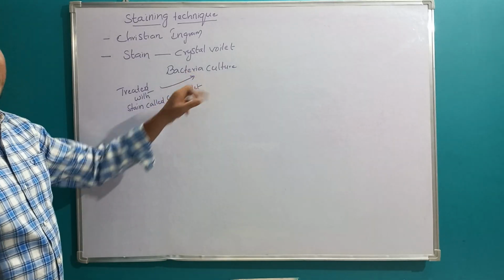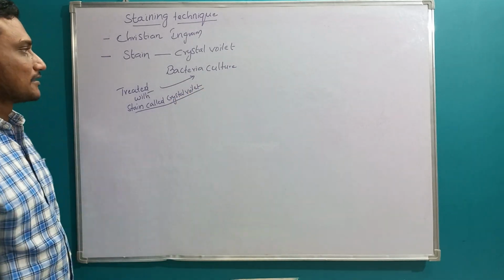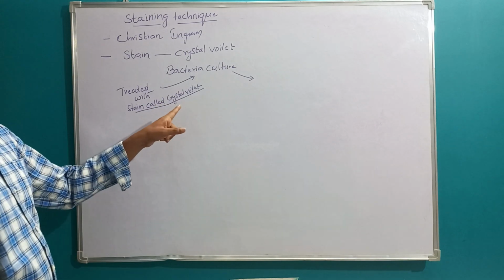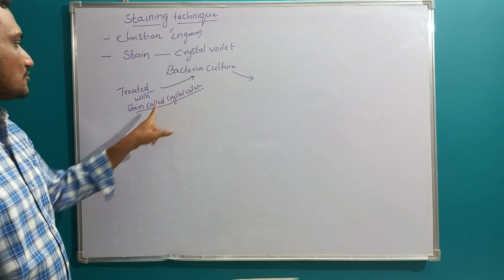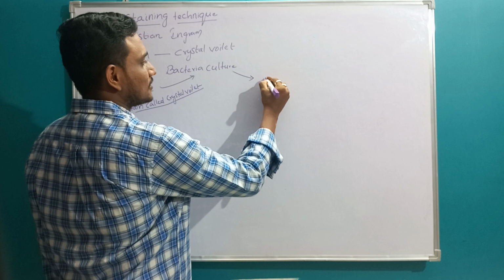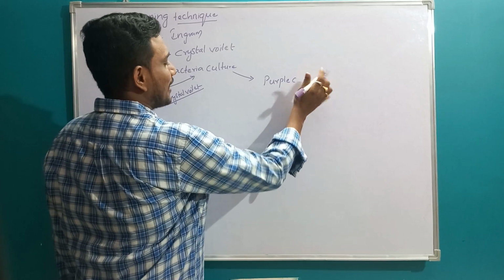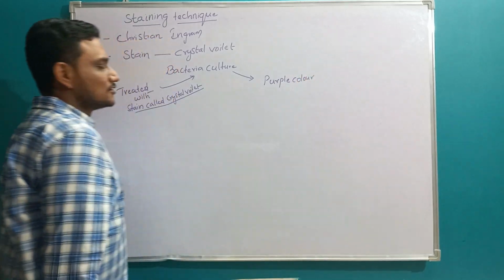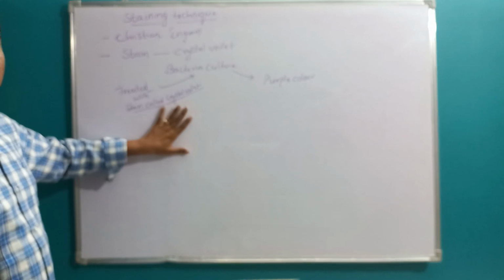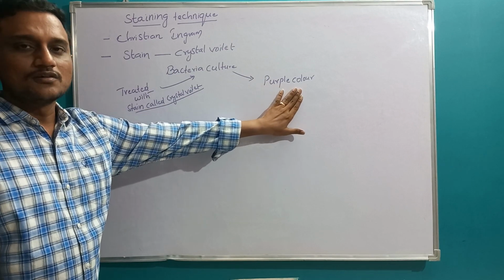The bacteria present in this culture, by absorbing this stain, turned purple in color.